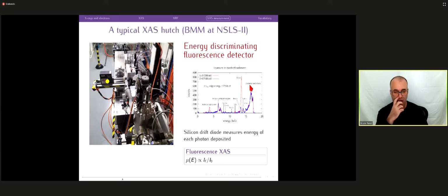The easiest way to think about Compton is that in whatever the sample is, there is some kind of sea of electrons that constitute the material. And the photons that come in and hit the sample have some non-zero probability of exciting some kind of collective excitation in the sea of electrons in the material, such that they lose a little bit of energy, an amount of energy that's measured in the tens or hundreds of electron volts. And so instead of just seeing the elastic peak, as you go to higher and higher energy, you see an increasing probability of measuring this Compton peak, which is energy shifted downwards because a little bit of energy has been lost to a collective excitation in the sample so that the photon that bounces off is a little bit lower energy. Compton spectroscopy is a thing and can be used in certain situations.